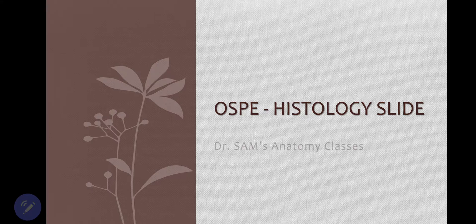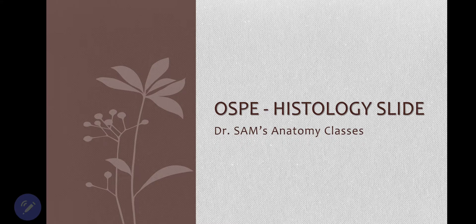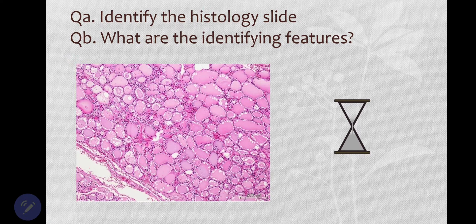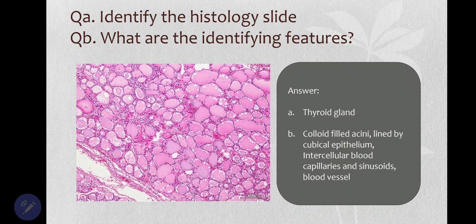This is an OSCE histology slide. Identify the slide and its identifying features. This slide is of the thyroid gland. Now, how do we identify that it's thyroid?